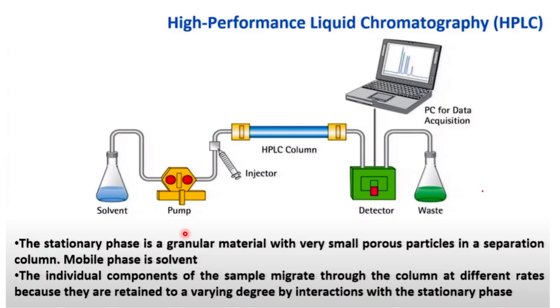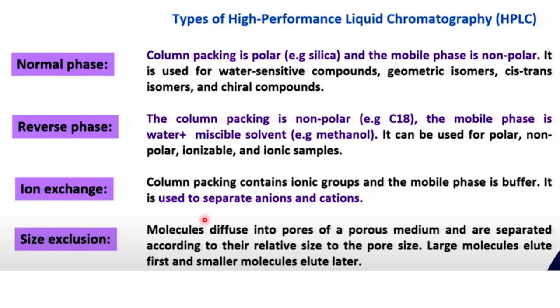So for that, you should first dissolve your sample in a solvent, preparing a very dilute sample, and then inject it. After that, with time, the different individual components will come out. Now in HPLC, there are four different subclasses.